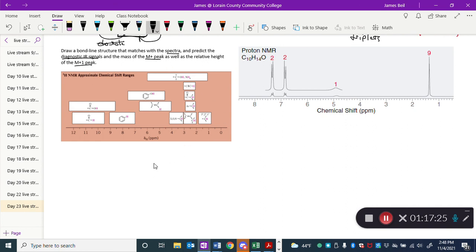All right, so the first thing I'd want to do, if I have an NMR signal, is look at the integrations. Those tell me how many hydrogens are producing each signal. I'll look at the splitting patterns and where the shift is. So probably I would start with the shift and the integration. Here I've got a peak that's between 1 and 2, so that limits what's happening. And this signal represents 9 protons. So that's probably a tert-butyl group like we were just talking about. Typically, to get 9 protons that are all equivalent and give the same signal with no splitting, I've got to have a tert-butyl group.